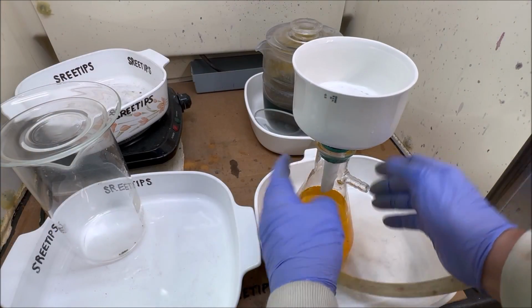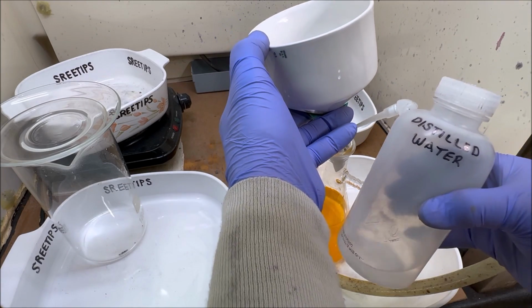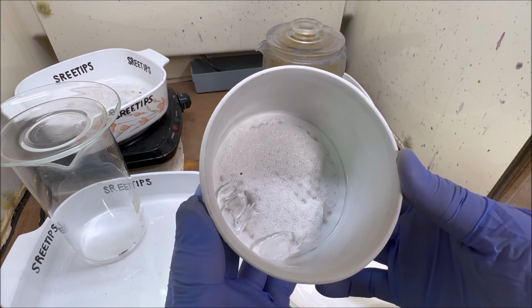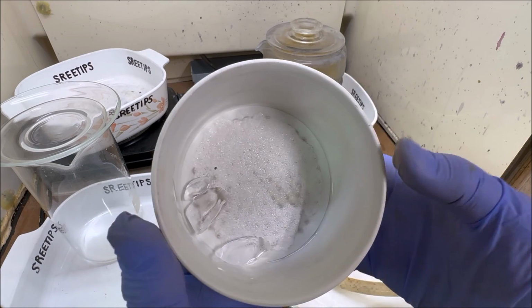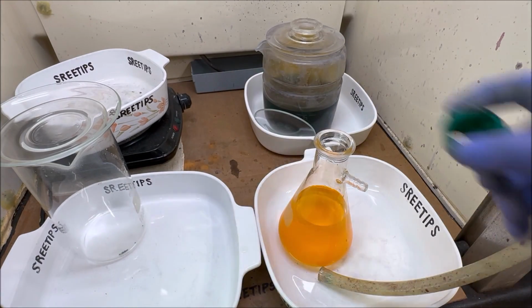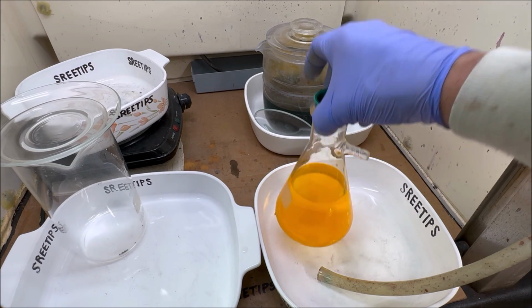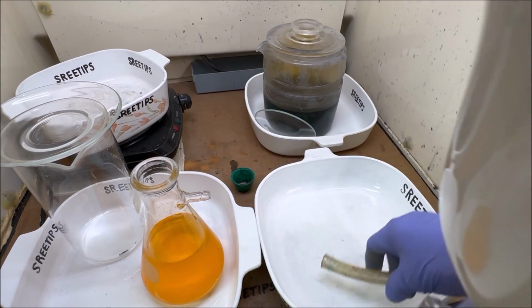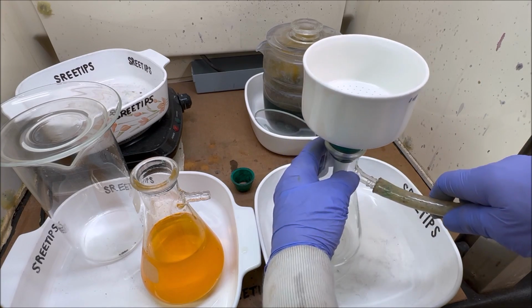Let's see what we got here. This is our filter. What I'll do is, I'm not going to add that to my paper storage. I'm probably just going to trash it. It's probably some kind of lead. So what we'll do here now is I've got a new filter rig. We'll bring this up, get this ready to go.